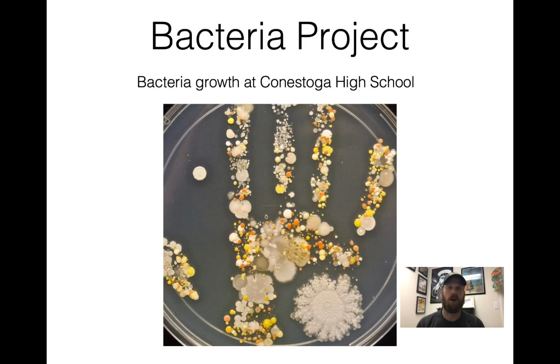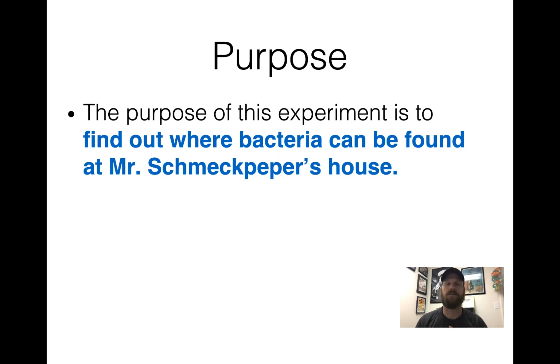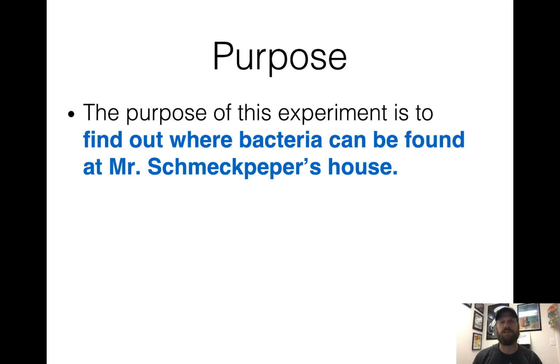It is time for our bacteria project. Normally, we'd roam the hallways and classrooms of Conestoga High School, swabbing different locations to test if bacteria is growing in that location. But because of the circumstances we're in, we will do that same project in and around my house. So the purpose of this project is to find locations where bacteria is growing in my house. More on that in just a second.